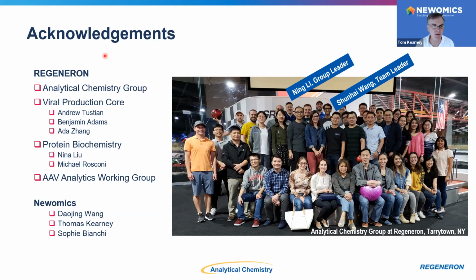Is the data presented using CDMS? I saw this come in the middle of your presentation. So I think maybe if you showed that schematic you had of the setup you were using for the LCMS, that might clarify that one.